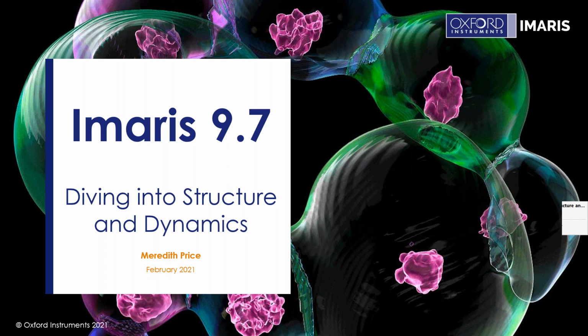I'm going to take a little bit of time first to introduce Imaris in general to anyone that perhaps hasn't used Imaris before or doesn't know much about it, and then I'll dive into the structure and dynamics.